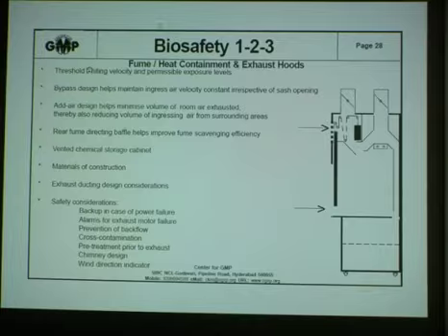So you have here some interesting features. You have a sash that is moving up and down. Regardless of the position of the sash, the air velocity entering the fume hood should remain constant. If a fume cupboard is not designed properly, whenever the sash is high, the entry velocity falls. And whenever the sash comes down, the entry velocity is so high that usually the flames, if any, are put off. To ensure that the intake velocity or entry velocity is constant, there's a very special design here.